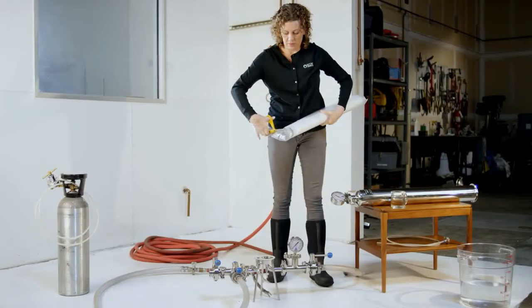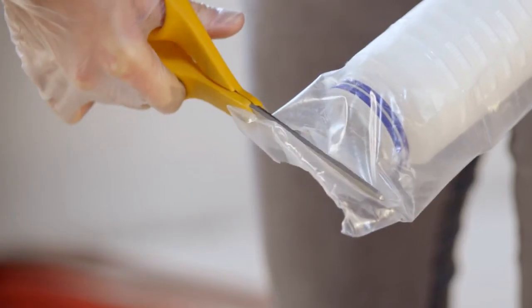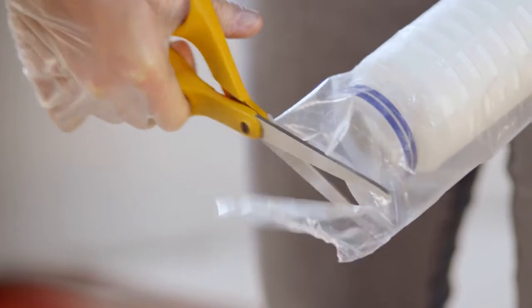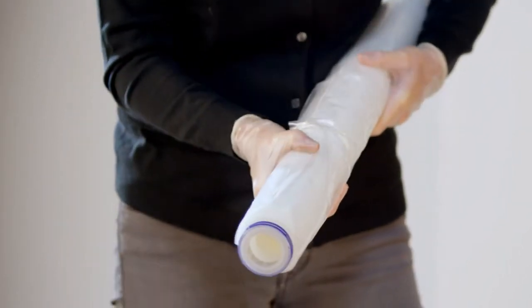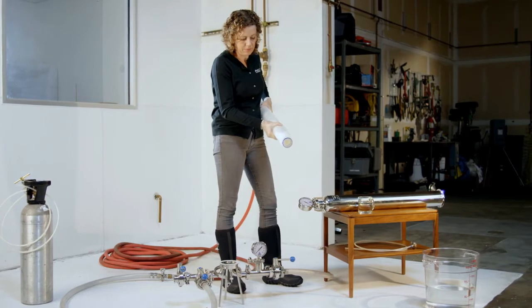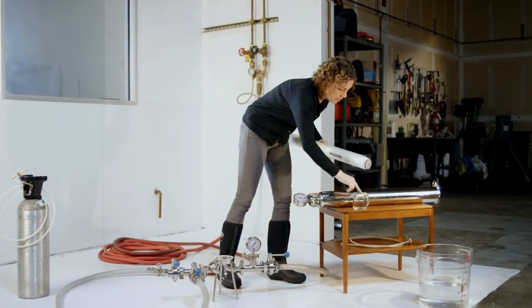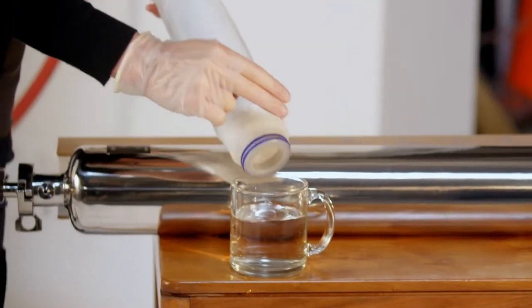When removing the cartridge from the box, cut open the O-ring end of the bag. While handling the cartridge, it's important to avoid contact of the filter media with bare hands or oily surfaces, as this may disrupt the wetting of the cartridge during testing.